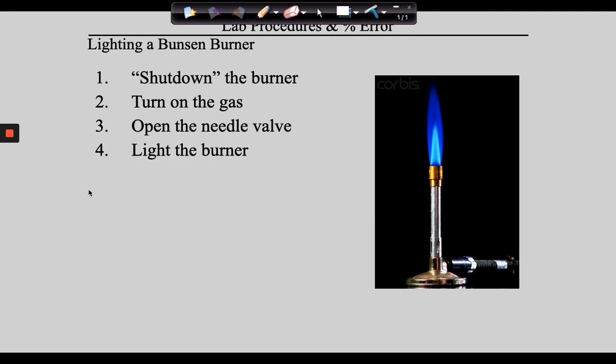In order to light the Bunsen burner, you got to figure out how to make this thing spark. Yeah, it's a welding striker. It's called a hooded striker. So guys, you can squeeze this thing until your hand cramps up and it will never light. So how do you get this to spark? Ready? Write down the four words, left-handed gangster gun. If you can remember, seriously, if you can remember left-handed gangster gun, you can get this thing to light. It can't be right-handed. It can't be a traditional gun. It has to be a gangster gun.